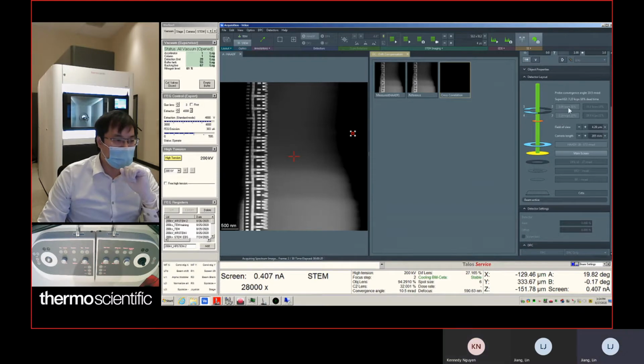It's still got a lot of counts. The count's getting a little bit lower. Because I see the one side's about between 3 and 6, and the other side's 30. Yes.